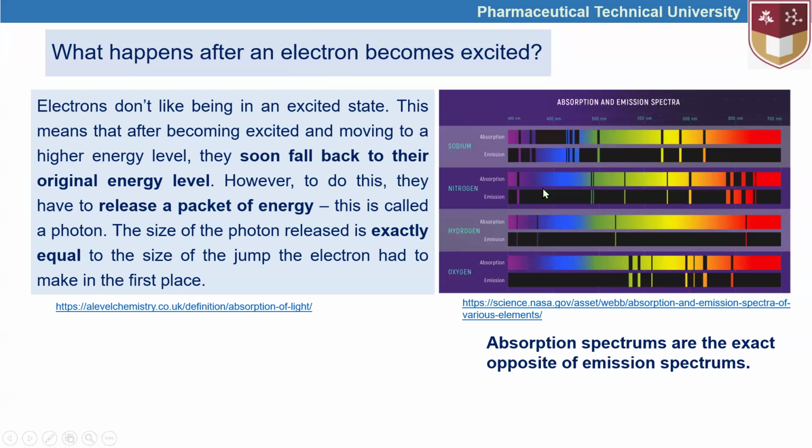This means that the absorption of some ranges equals the emissions, as shown and explained here, because the electrons can absorb the exact, short range of, let's say, this orange color in this case, while they are jumping from one state to another.